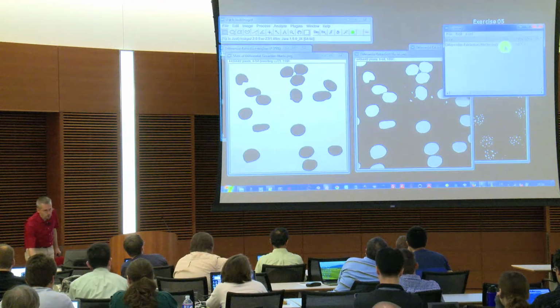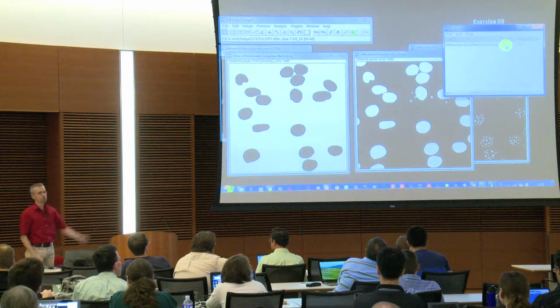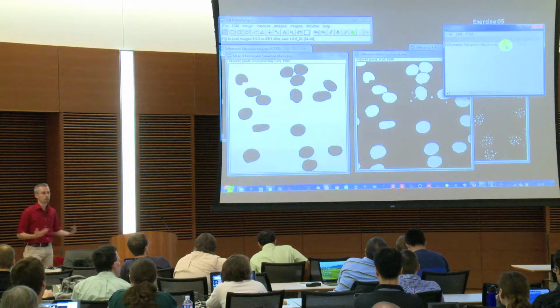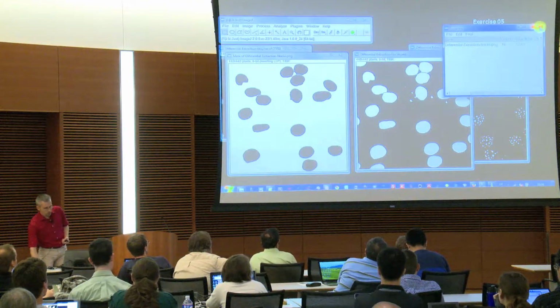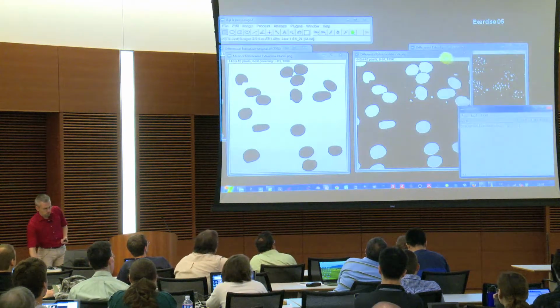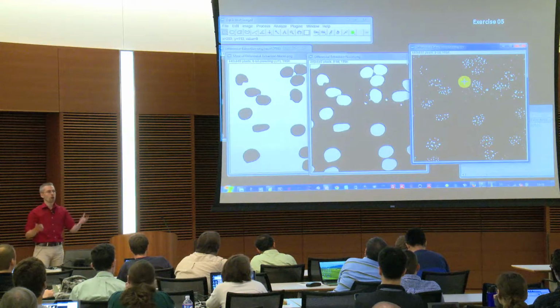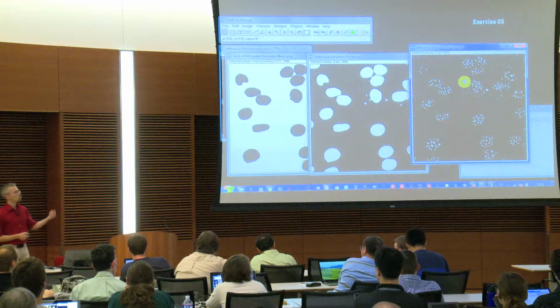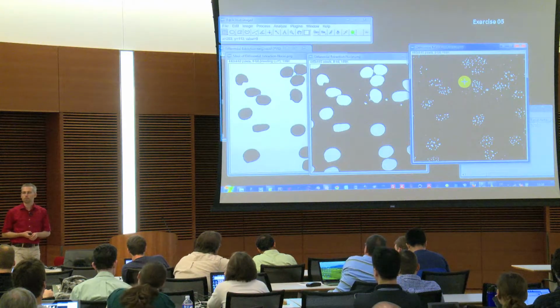And in the summary window, it directly tells you the count: 16. That means what we have currently in the image are 16 of those nuclei which we have counted. So, 16 nuclei. Now what we potentially want to know is, on average, how many spots in this experiment do we have in these nuclei?